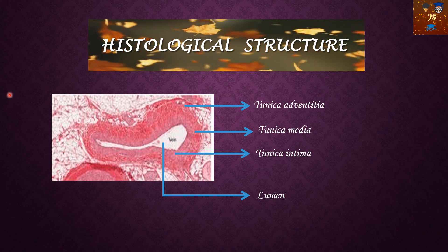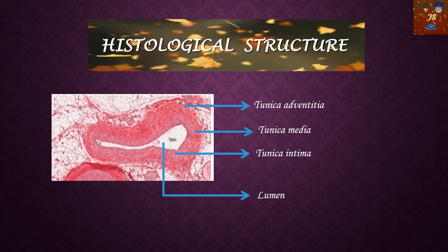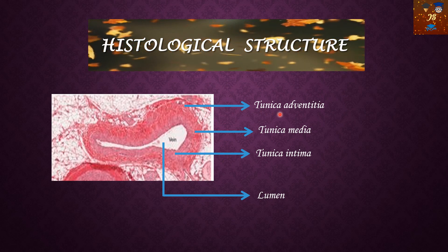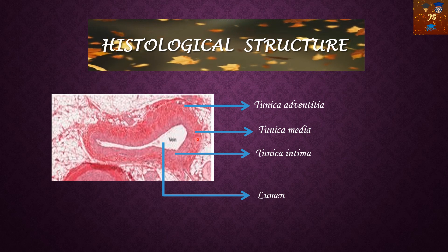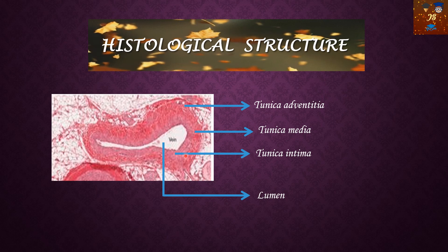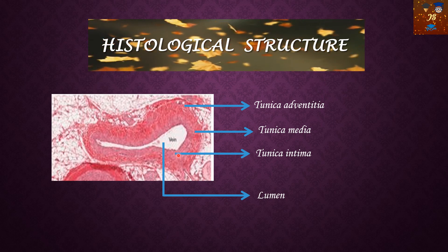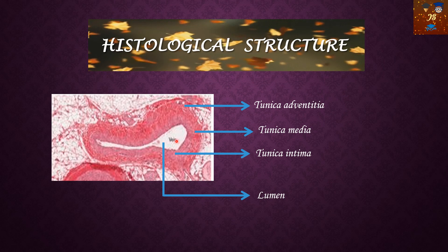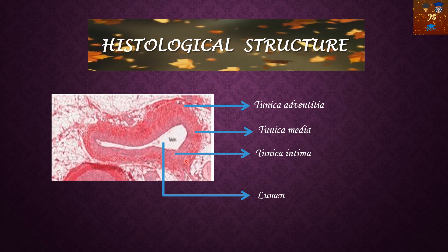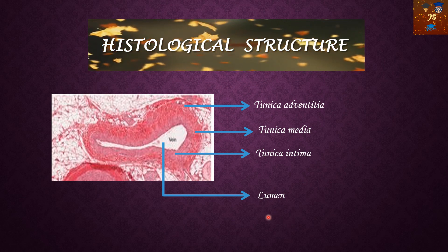This is the histological structure of the vein. Three layers are shown here: the outermost layer is called the tunica adventitia or tunica externa, the middle layer is the tunica media, and the innermost layer is the tunica intima, present close to the lumen. You can see the lumen is wavy in appearance — this is referred to as the wavy lumen.